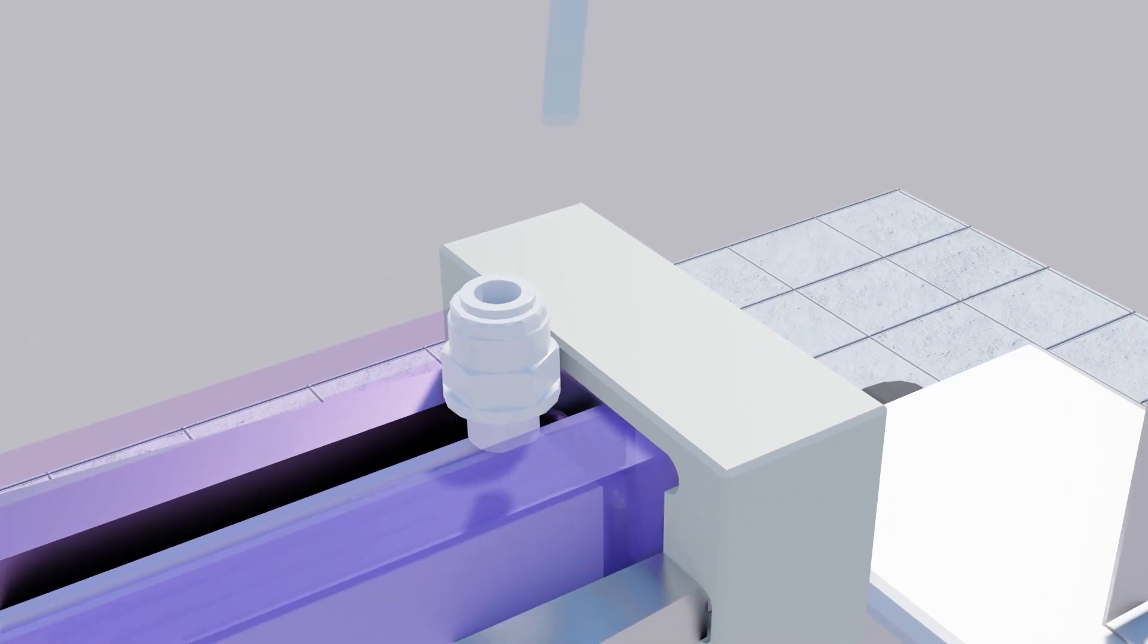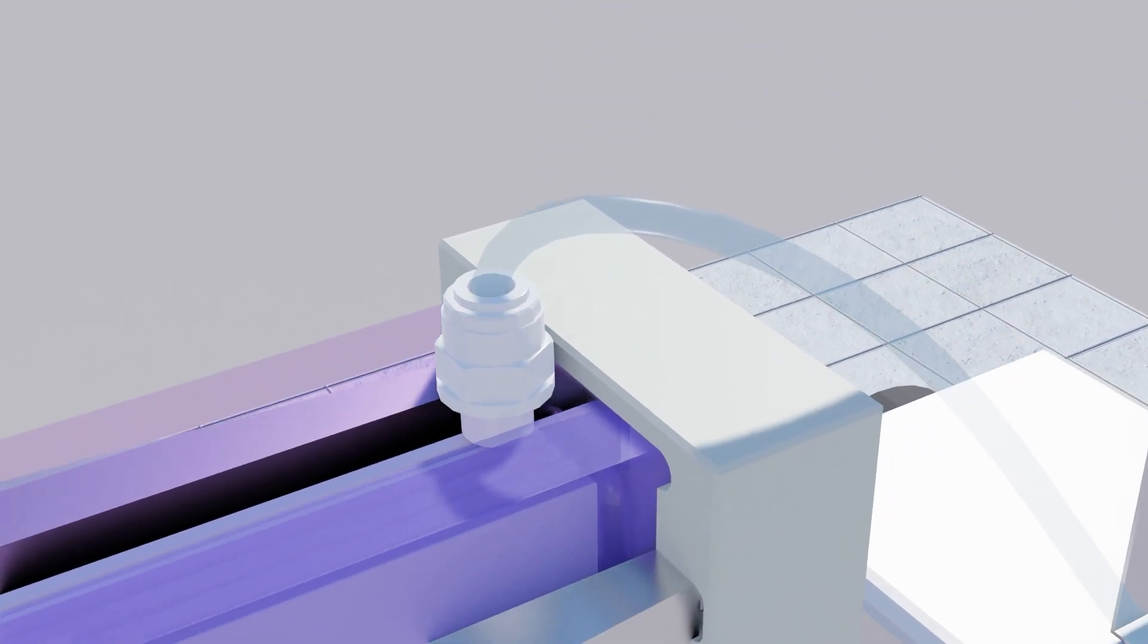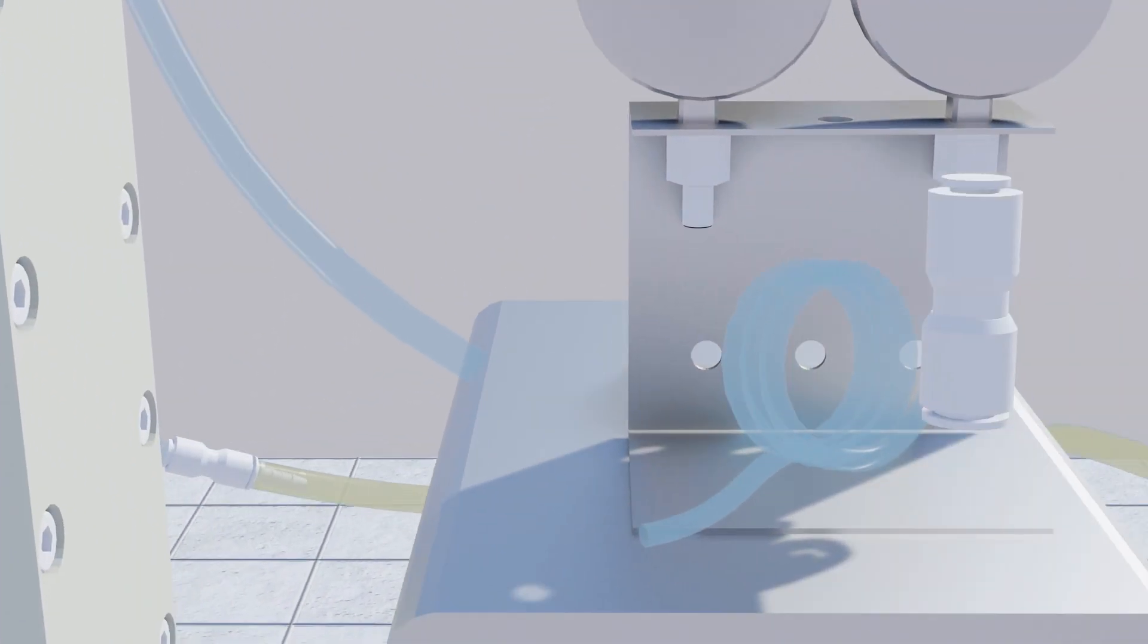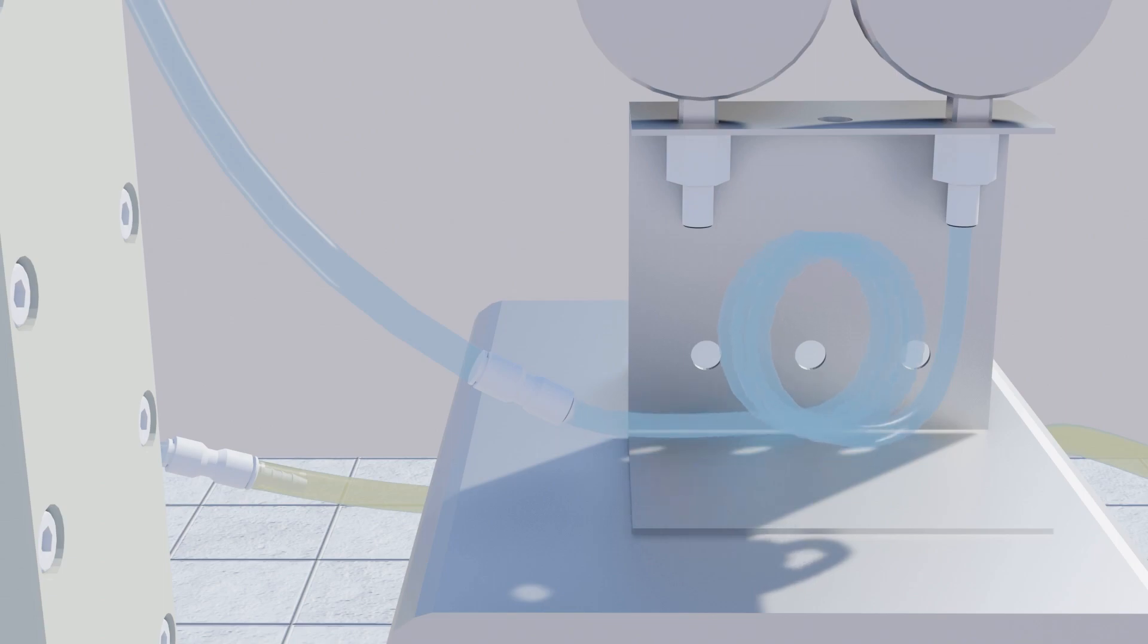To connect the manometer, connect the 8mm tubing to the other outlet port and use an adapter to connect the 8mm tubing to the 6mm tubing that leads to the manometer.